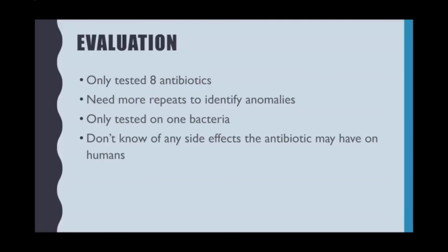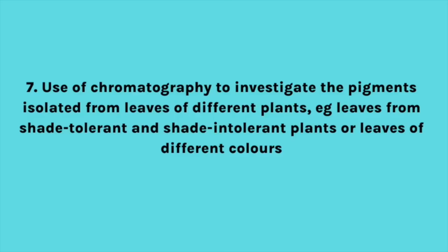Now in yours, you might need to consider as well any issues about you implementing the method. Particularly if you've got a contamination, this is the part where you need to reflect, where do you think it was that you weren't completely aseptic and how could you improve that?